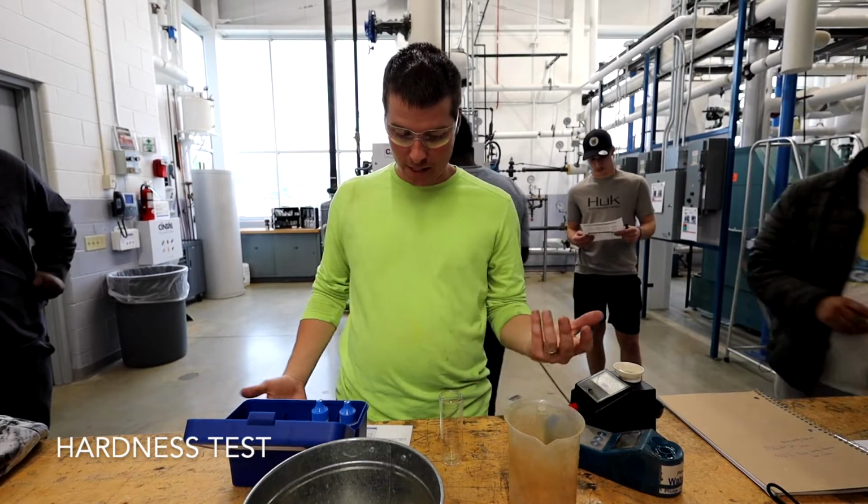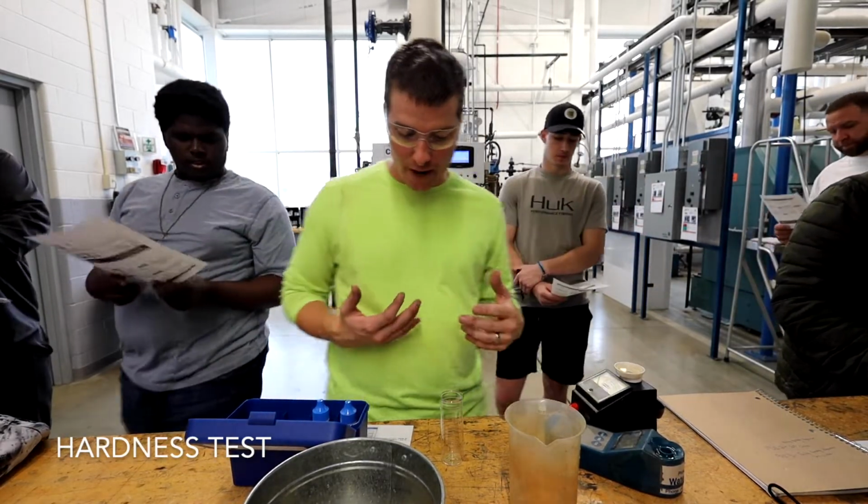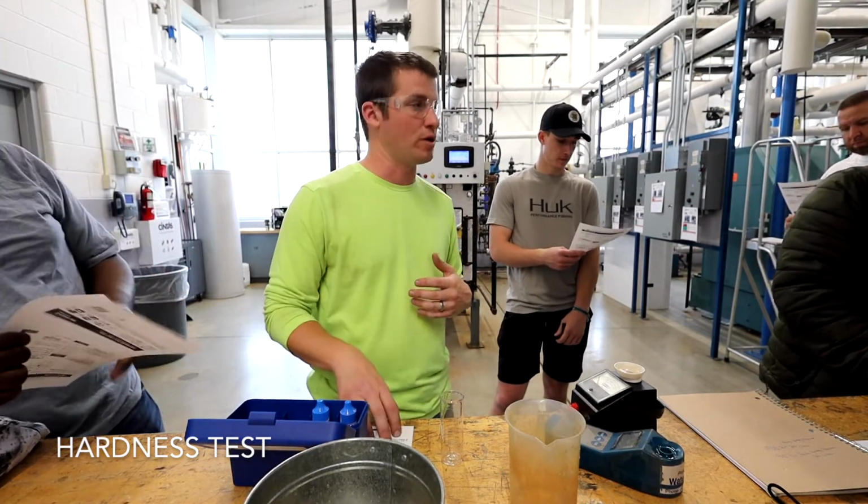All right. So you're looking at the instructions. Step 1, right? Rinse the vial 3 times with your sample, and then fill to the 25 ml mark.